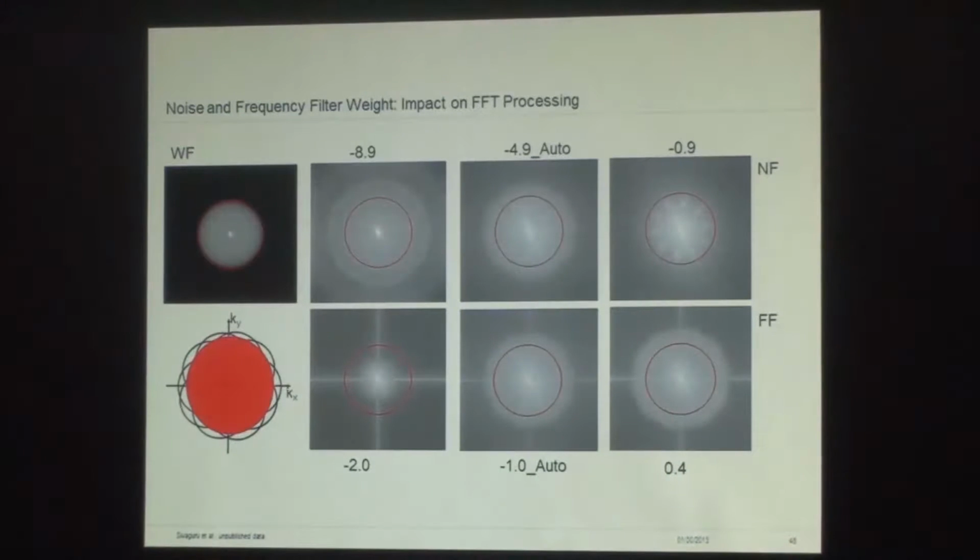So when you look at the actual images to see what these functions are doing, using the same images, I calculated them with the auto calculation, and obviously what you see here is the wide field Fourier transformed image. These are the frequencies I'm collecting from the actual system. But when you look at the super resolution calculated image, you can see the enhancement in the high frequency information compared to the conventional wide field. When I use auto calculation with the frequency weighting also auto at -1, you can see an almost isotropic distribution of frequencies with both the lower frequencies and high frequencies.